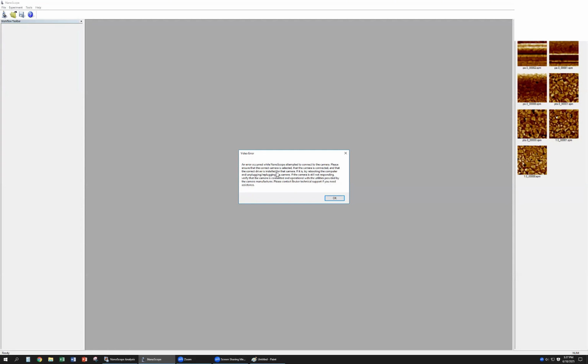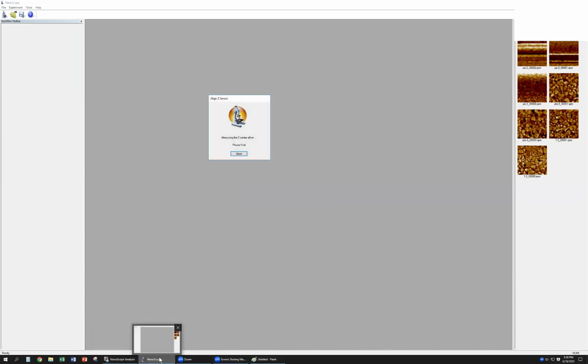So we have 2 kinds of probes. One you must calibrate yourself. For the other kind of probes, the factory already provides the calibrated data. This data includes K and R, but they just provide you the total data. Okay, so this one is accurate. I think we already opened another one, right? It's already opened.